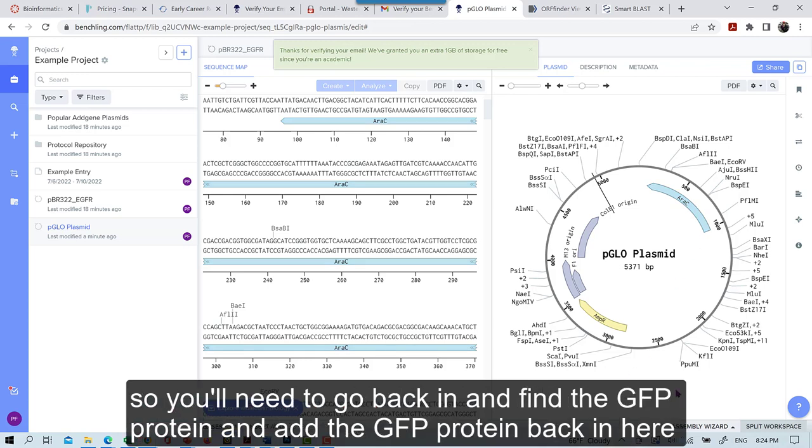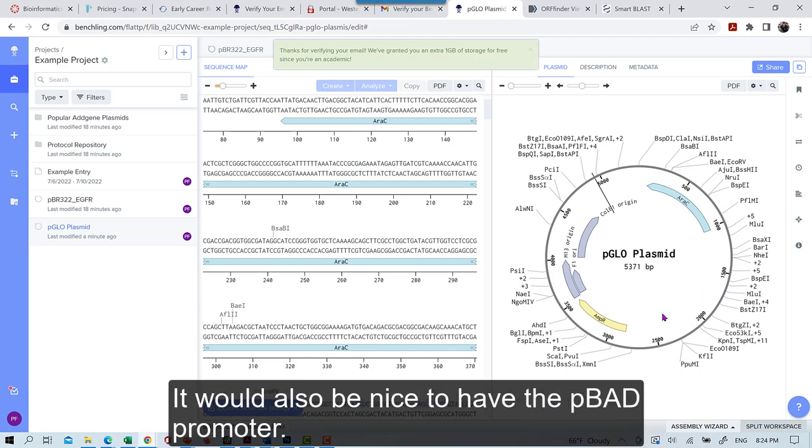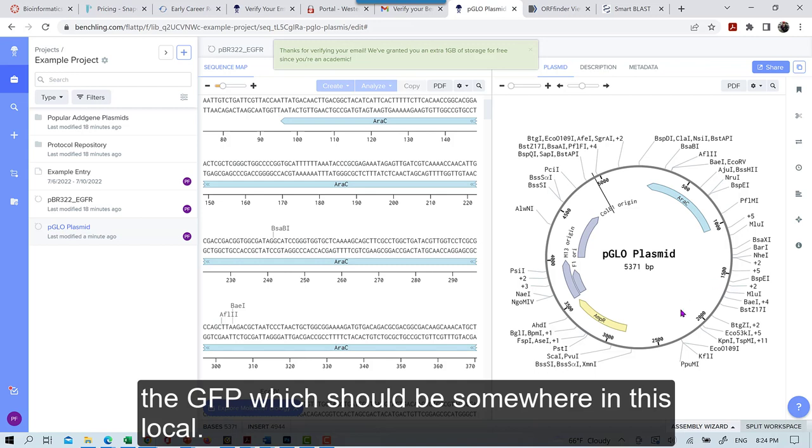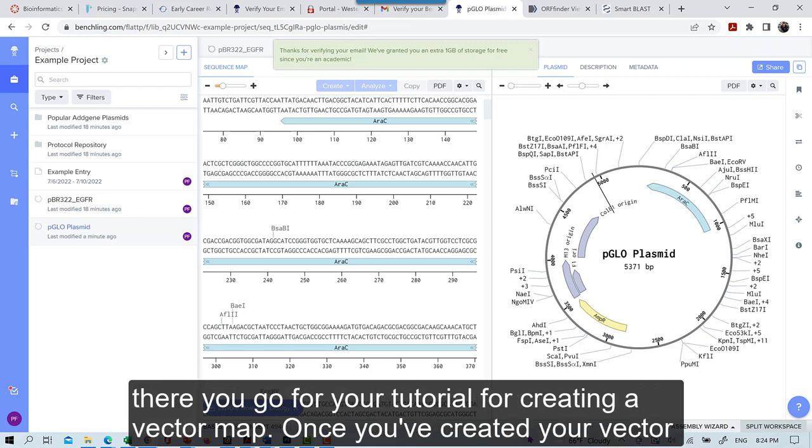So you'll need to go back in and find the GFP protein and add the GFP protein back in here. It would also be nice to have the PBAD promoter, but we won't worry about that for now. So you just need to get AeroC in there, and then also the GFP, which should be somewhere in this locale. Alright, there you go for your tutorial for creating your vector map.